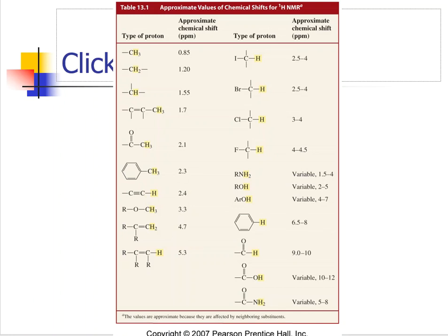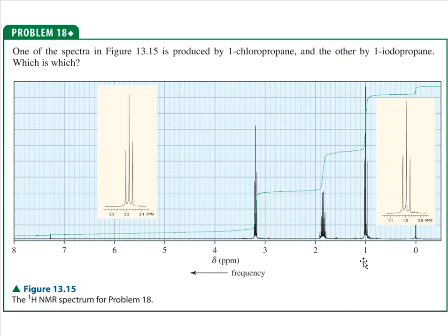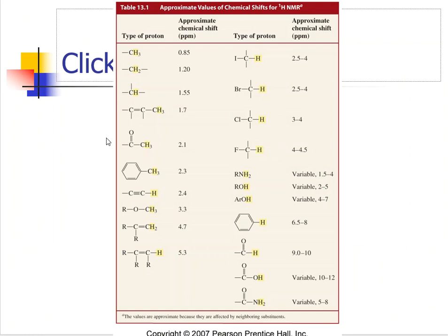So that way, when we start looking at NMRs that look like this, we can say, hey, we've got a signal at like 1.8, 1.9-ish, right? I see a signal that's going to be there. So what would be at 1.8 or 1.9? Well, this chart will come in handy for us. So I know automatically it's not going to be a halogen, right? Because these are way higher than what I saw on that NMR that I just briefly showed. So 1.8, 1.9s, where would those be? Well, it looks like we would be in this general area here. So keep in mind, not everything is listed, but it does a pretty good job of putting the common things that are showing up in the world of organic on a quick reference chart for you to use, okay?